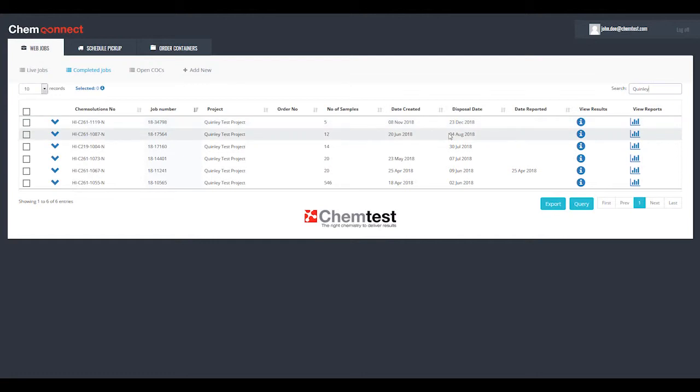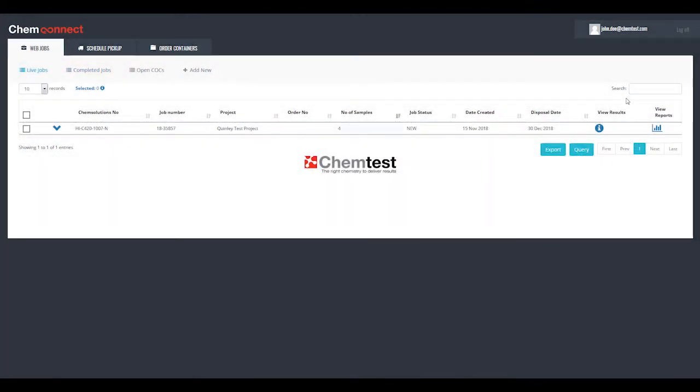The main difference between live and completed jobs is that the first contains jobs before the quality control step and can show outstanding testing on the sample. You can also use live jobs to create interim reports.